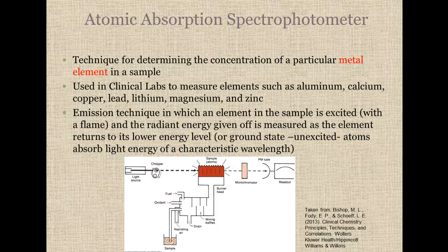There's also an emission technique in which an element in the sample is excited with a flame, and the radiant energy given off is measured as the element returns to its lower energy level, or ground state. Unexcited atoms absorb light of a characteristic wavelength.